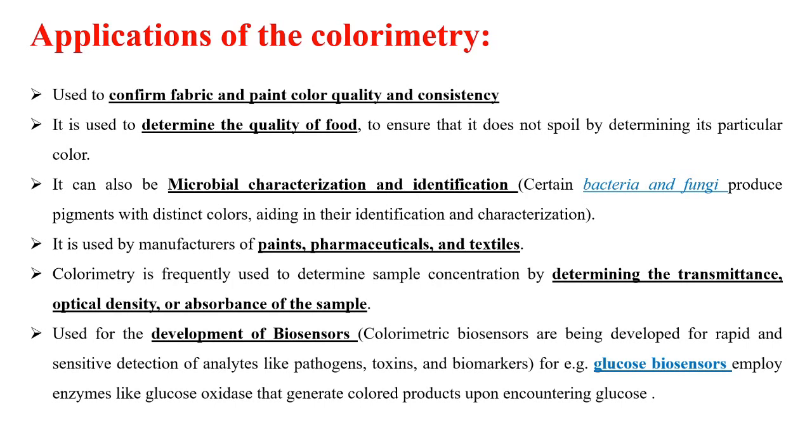These things should be there in your record book. Don't take it lightly. Capital C, capital I, capital E, lab, color space. No space between CIE and lab, okay? That is one word.